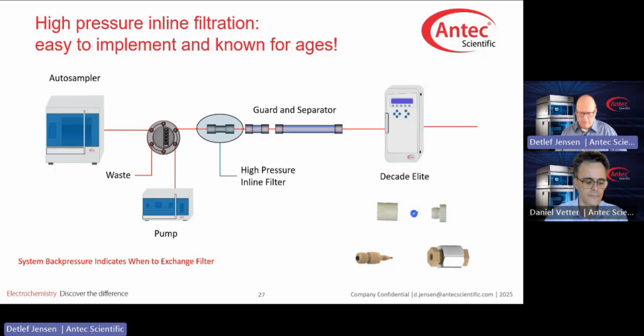It would involve stopping the sequence, replacing the filter cartridge or the filter disc, and then restarting the sequence.